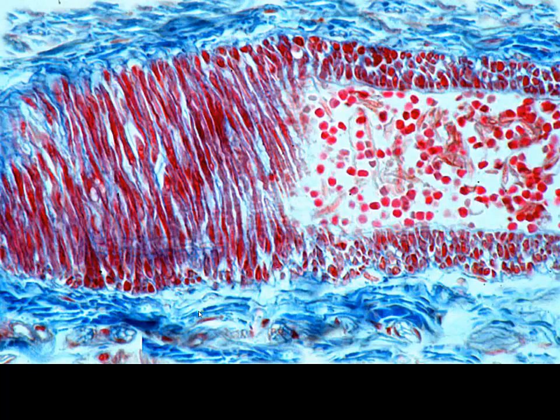Now this is an interesting section through a blood vessel. What we are sectioning through, on the right we have a longitudinal section, and we can see we've cut the nuclei of our smooth muscle in cross section, somewhat getting some of the endothelial nuclei in here, especially at this location. These are red blood cells. But then the blood vessel bends, and we're sort of getting a tangential cut through the circularly arranged nuclei of smooth muscle before we lose the plane of section and that blood vessel goes out of the plane of section.